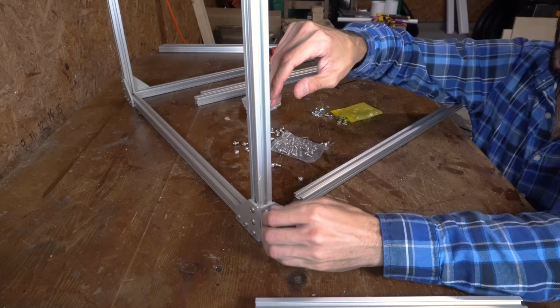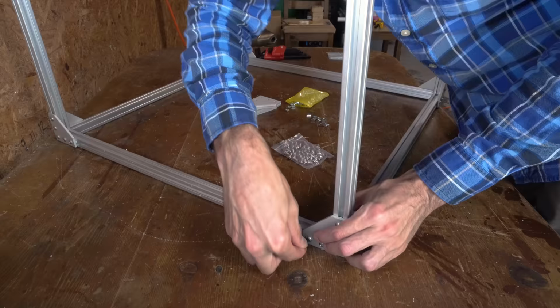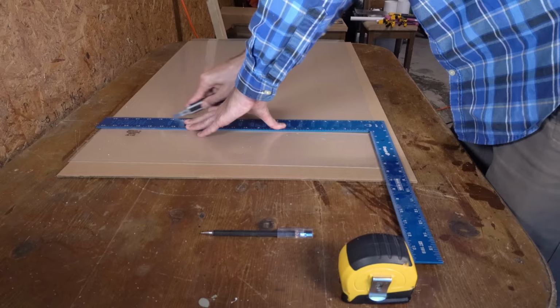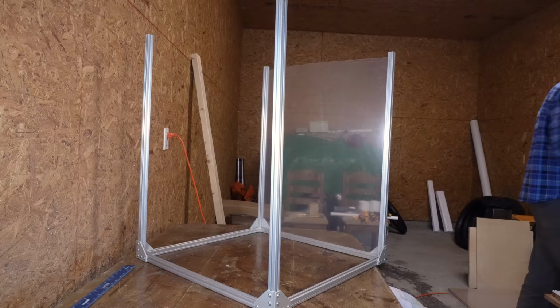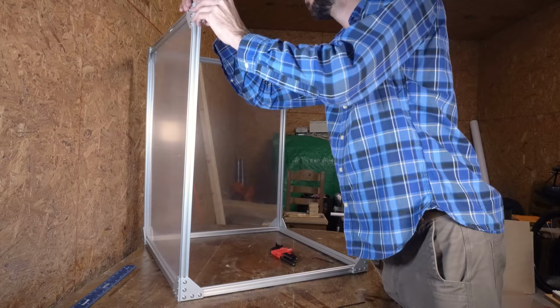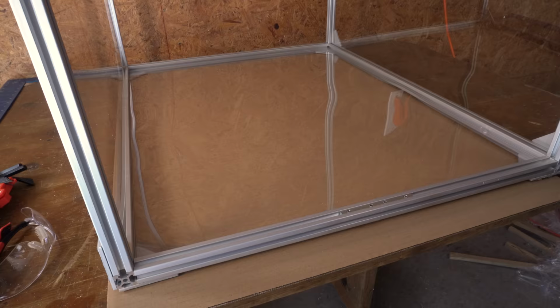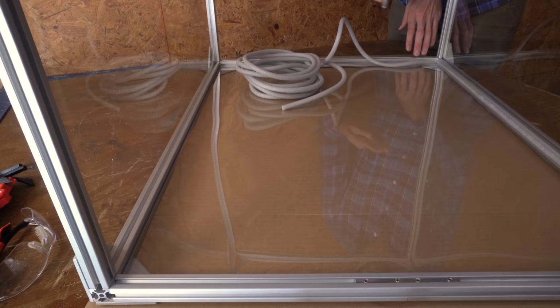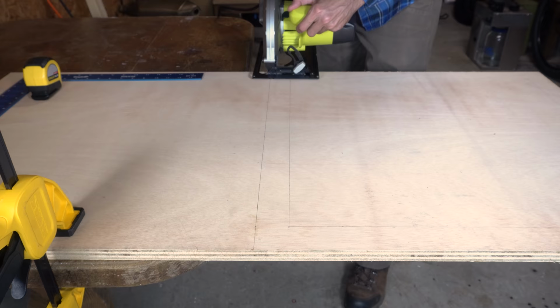To reduce the risk of contaminating the mushroom cultures, I'll need to build a laminar flow hood with a HEPA filter to purify the air I'll be working in. The frame of the hood is built from extruded aluminum rails, and the walls are clear plastic panels taken from poster frames. And since my blower fan is smaller than the HEPA filter, I'll need to build an adapter plate to join the two.